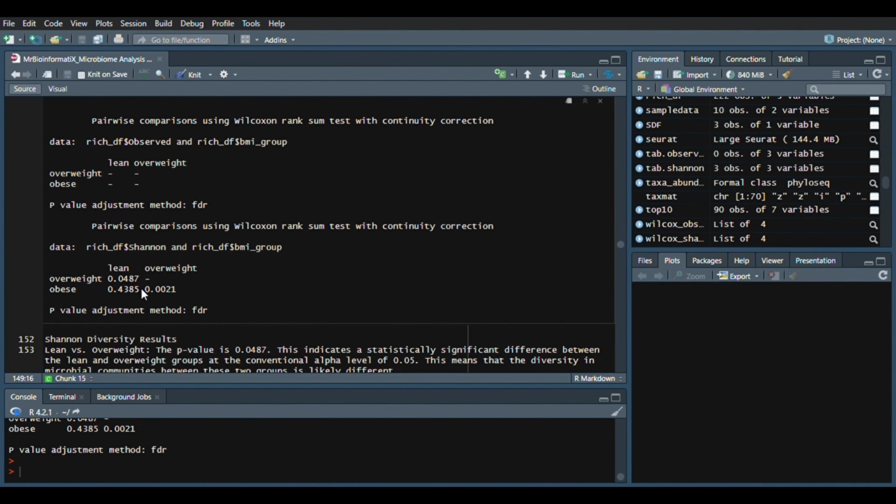Now, let's go for beta diversity. This concept helps us understand how different groups of microbes are from each other. Beta diversity measures how unique one neighborhood is compared to another. In our study, we want to see how diverse the microbial communities are and how they differ from one another.